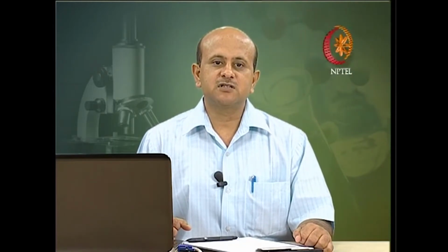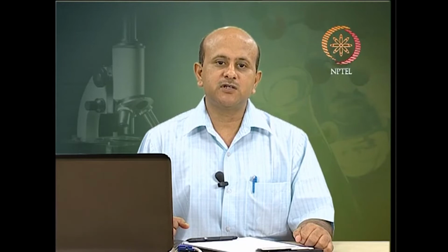So, there are various methods, and like we discussed, there are two important instruments here, dispersive and Fourier transform IR spectroscopy. There are a lot of applications of IR spectroscopy.